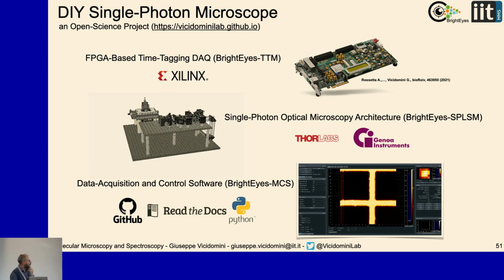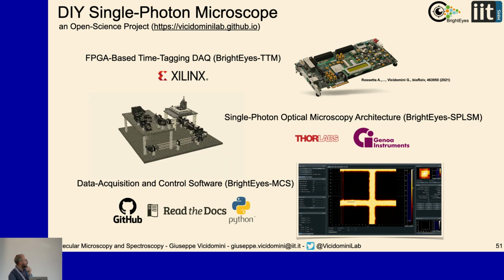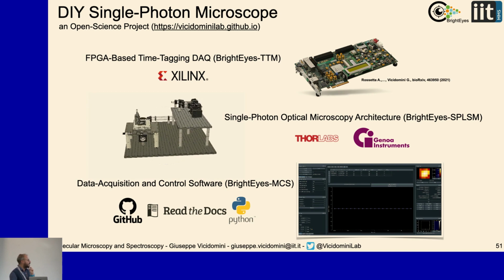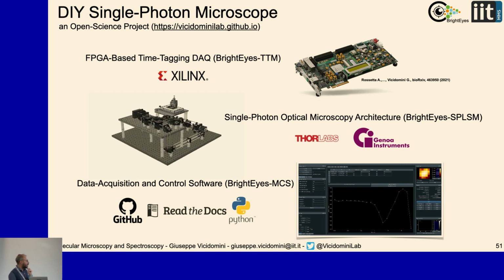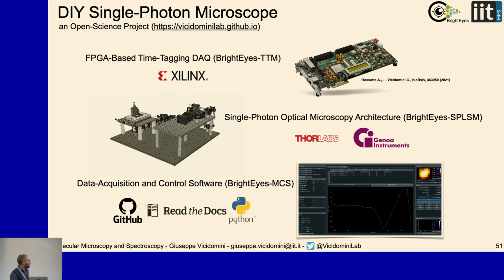We can provide the CAD drawings to build a single photon microscope in your lab, and also the controlling software, because you can imagine that a big part of this project is the good software we have to control everything and to acquire all our data.